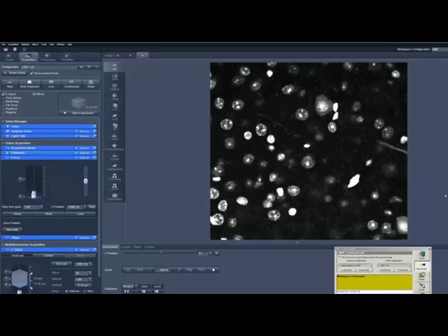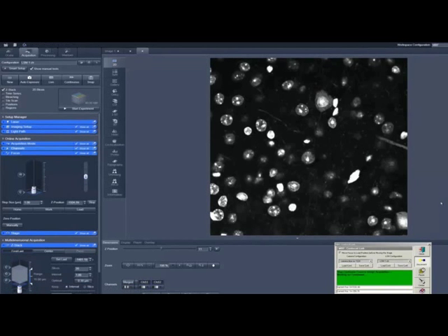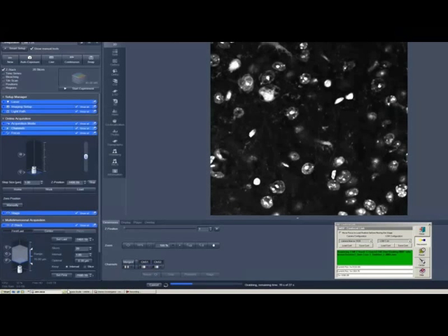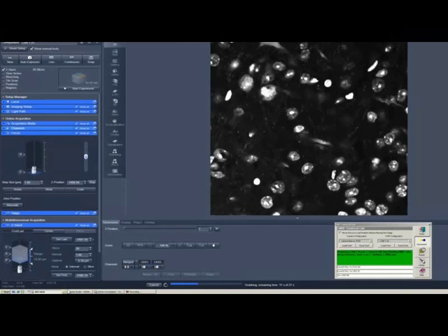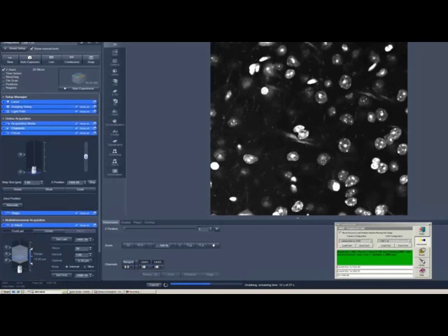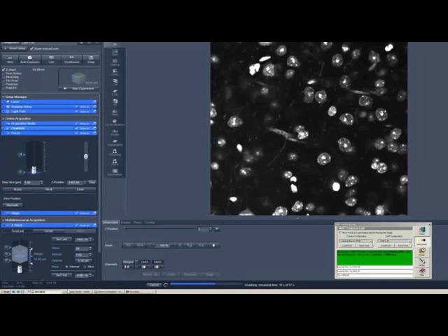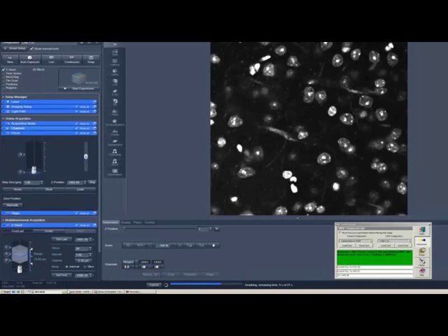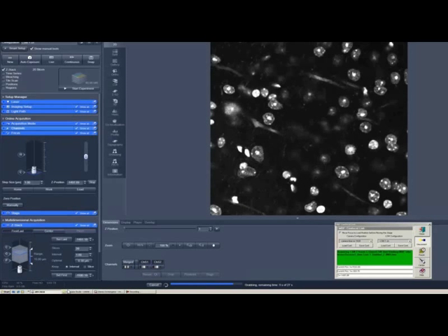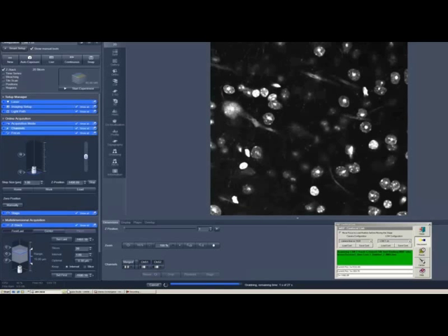And in fact, what we're demonstrating now is relatively short. We only did one section, but Stereo Investigator allows you to specify capture of multiple sections and assign them all to the right locations for you if they're all located on the same physical glass slide. And so you could really set this up to acquire bilaterally 12 to 15 sections if you want. Right. Once you get your imaging parameters established and the rest of the hardware set up, it's really a quite simple process to get through.